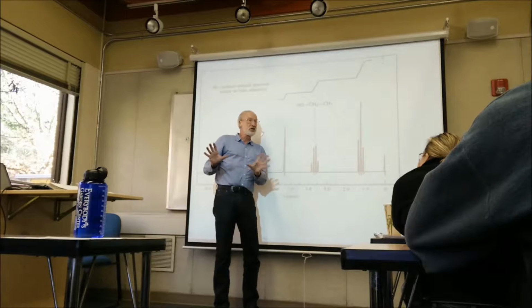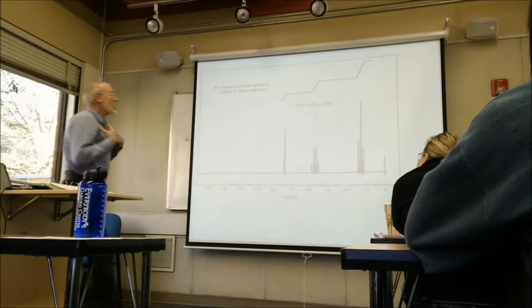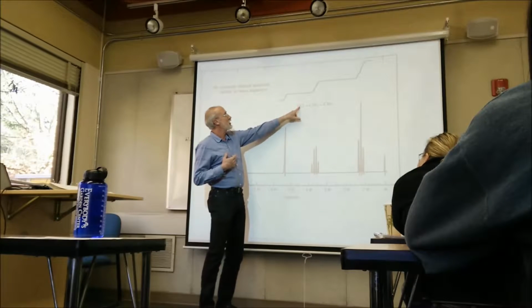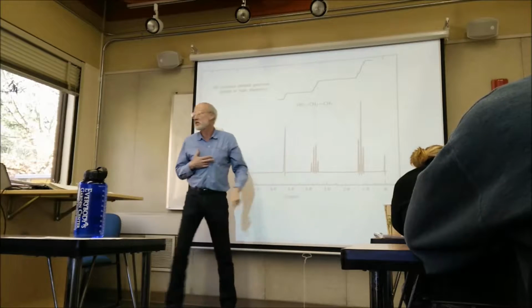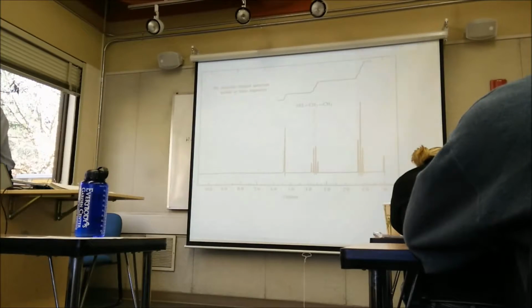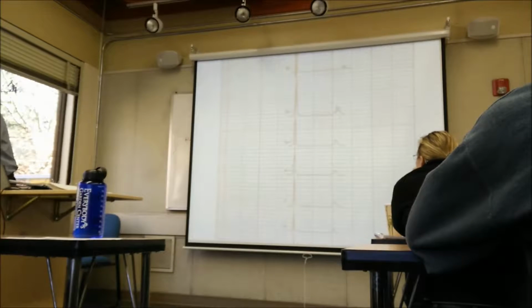So when you've got hydrogens on oxygens or nitrogens, sometimes the splitting is not there. And I told you that that happens if this thing is coming on and off at a frequency that's substantially greater than the frequency at which this thing resonates. There's another way to change the speed at which the thing comes on and off, and that is to change the temperature. So here is a series of spectra of ethanol at different temperatures.